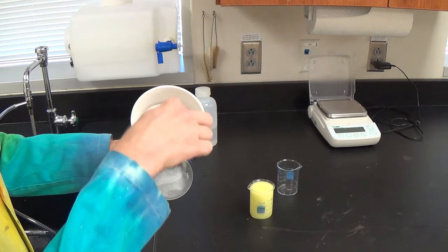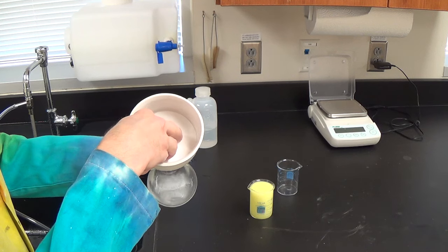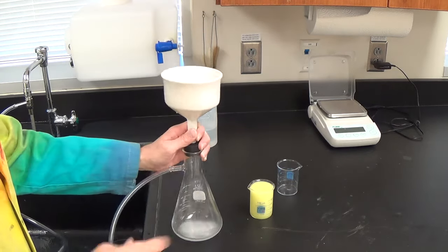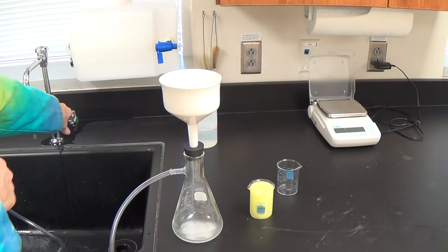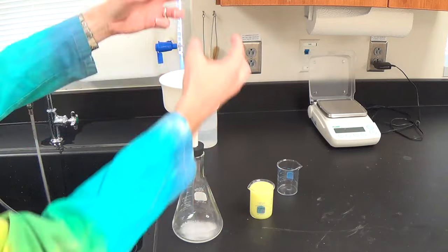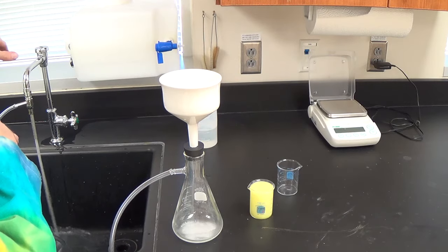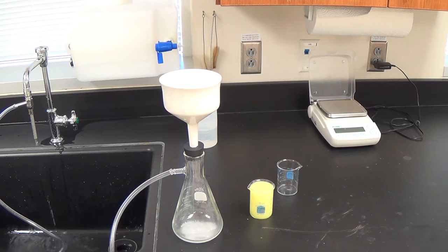The paper is bought so that it specifically fits the inside of the funnel. This is a Buchner funnel, by the way. So it fits the inside perfectly. You have to match your paper with your funnel. And if I were to turn on the water now, I'm going to get active air being pulled through the filter paper into the flask and then through the faucet. Right? This is where I'm going to put the precipitate.